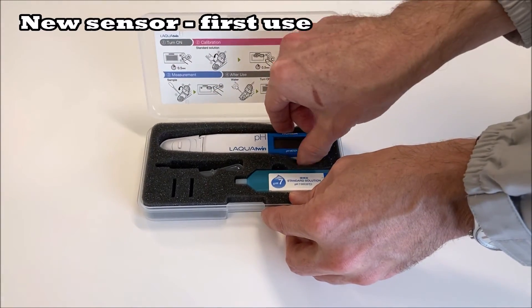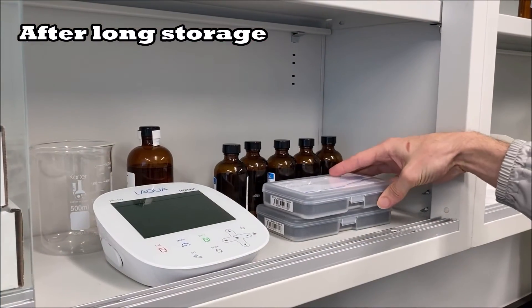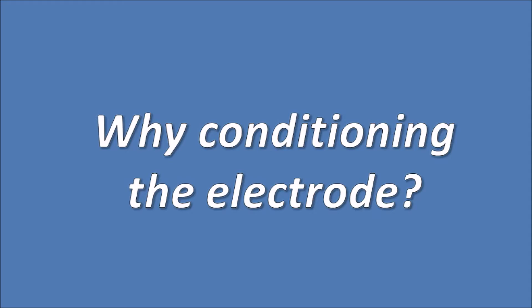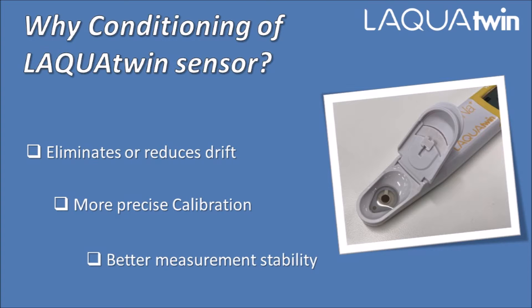Horiba recommends Laqua Twin users condition sensors when the meter is used for the first time or after storage periods of two weeks or more. Sensor conditioning prevents drift issues and helps to improve precision in calibration and electrode stability.